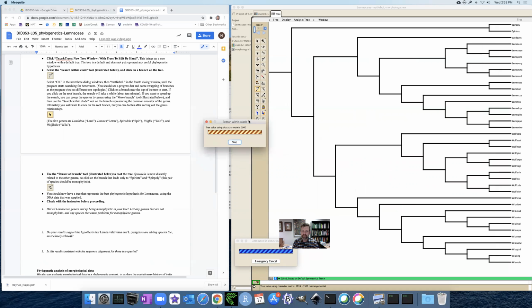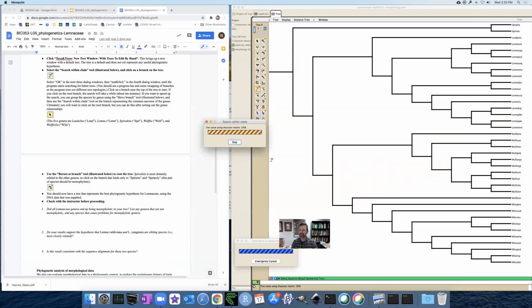And I don't think I'm going to have patience to make this run all the way to completion, especially when it kind of stops. It's working, but you don't see any improvements for a while. It gets a little impatient, right?